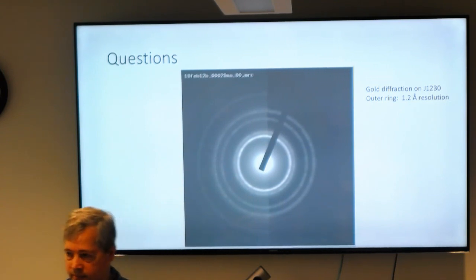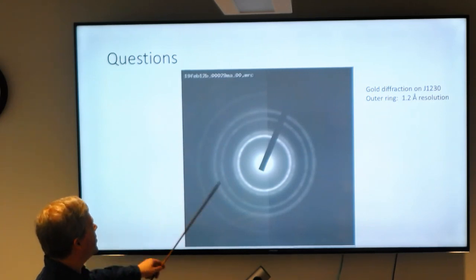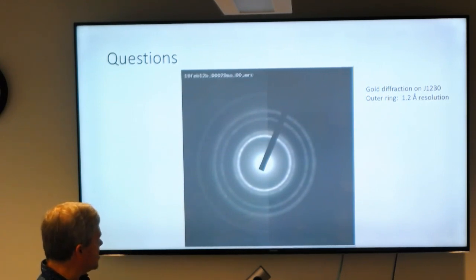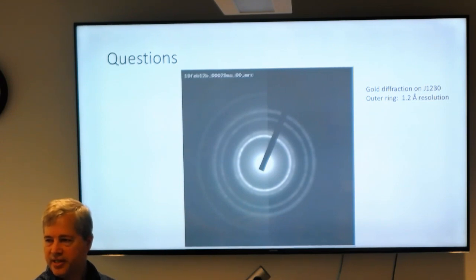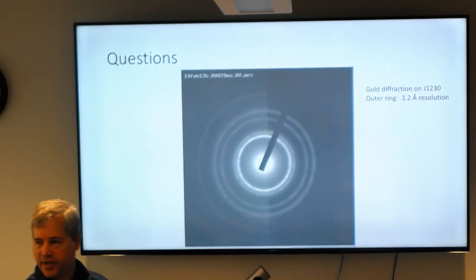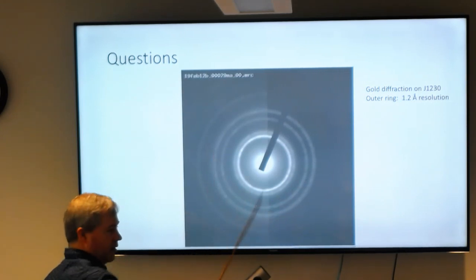So when you see rings like that, that's typically different lattice features. The reason you see rings is that, ideally, if it was one lattice you would see spots, but this is actually sputtered gold onto a carbon grid, so there's a whole bunch of lattices, enough that it appears almost like a continuous ring. But ideally it would be individual spots all along that ring.